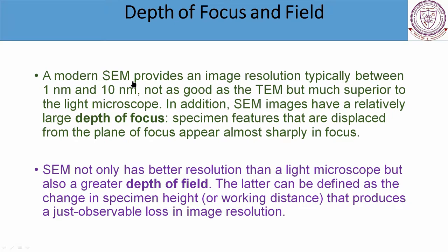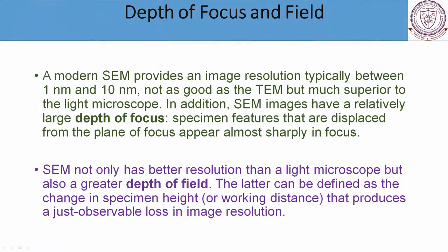So now we are going to discuss in the next slide further the depth of focus and the field. In any modern SEM, you will be able to see a resolution, a term I'm going to explain later, of the order of 1 nanometer to 10 nanometer. It is not as good as the transmission electron microscope, which I will explain later, a far more competent microscope than the scanning electron microscope. But there are features of engineering importance that will permit you to infer something at this length scale itself. So there is no fun in going for a transmission electron microscope.